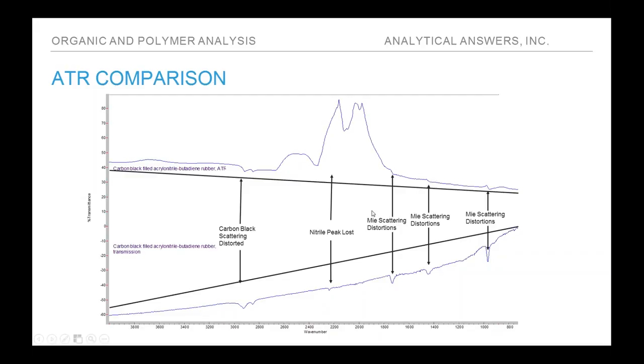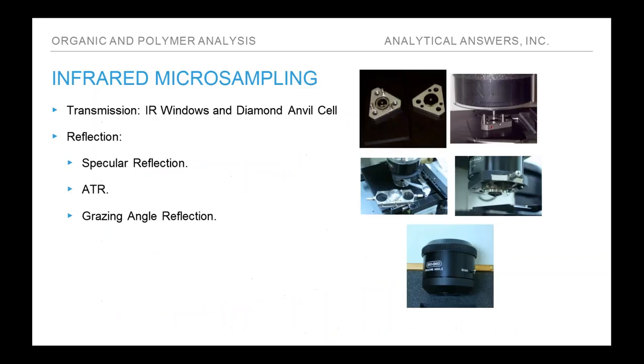So again, ATR sampling is very popular and can be used as a very easy, very simple sampling technique. But if you're not aware of the limitations, you can very quickly run into serious problems.